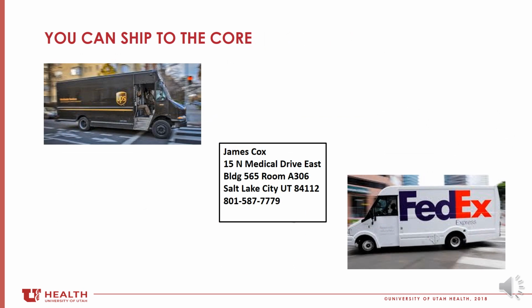If you don't live in Utah, you can send packages to us. Just pack your samples on dry ice and then send them to us by UPS or FedEx to this address here. This is also listed on our website. Send us a tracking number for your package and we'll track it for you and alert you when it arrives.